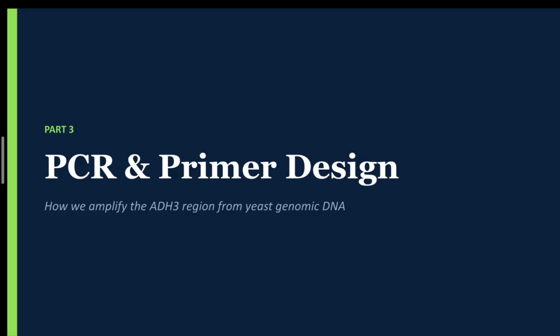Okay, so now let's look at PCR and primer design. So how we amplify the ADH3 region from yeast genomic DNA.